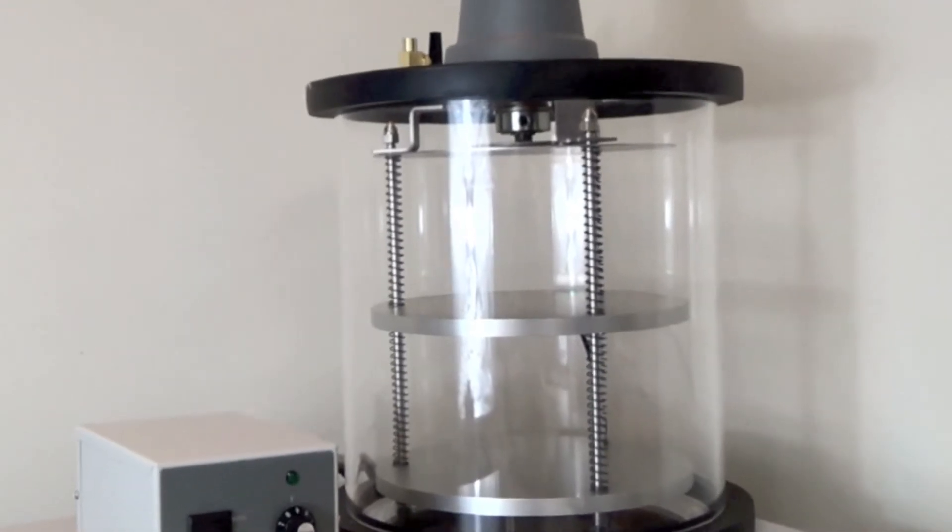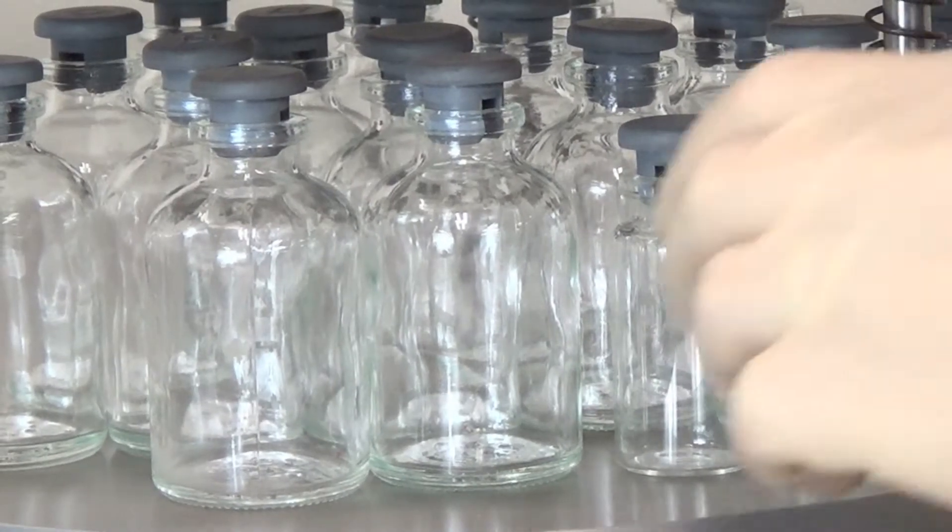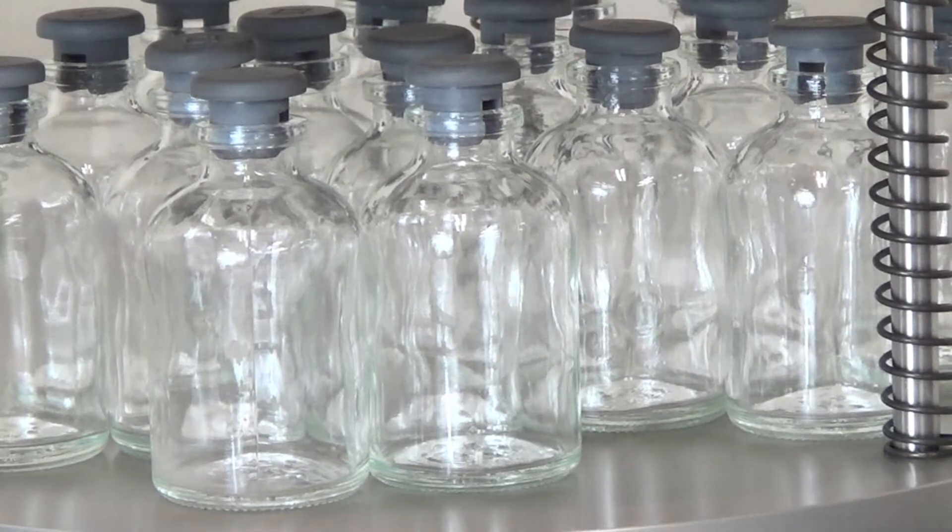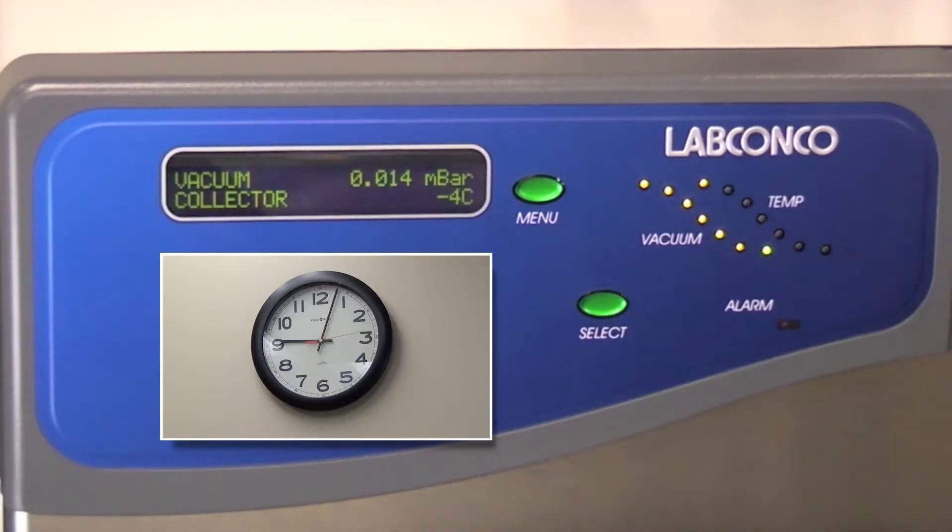Using the clear stoppering chamber is easy. Pre-freeze your samples in vials that are partially stoppered. Start the freeze dryer in manual mode and wait until the refrigeration reaches negative 40 degrees Celsius.